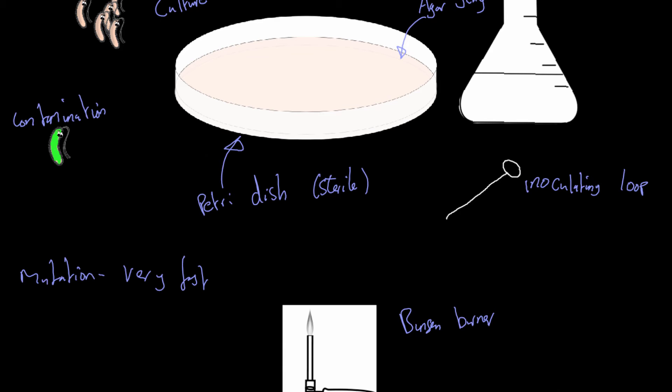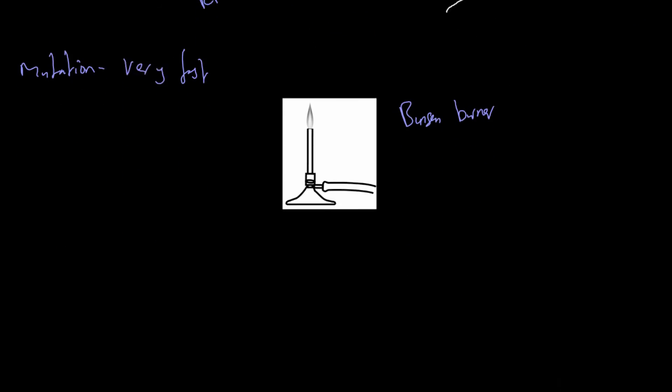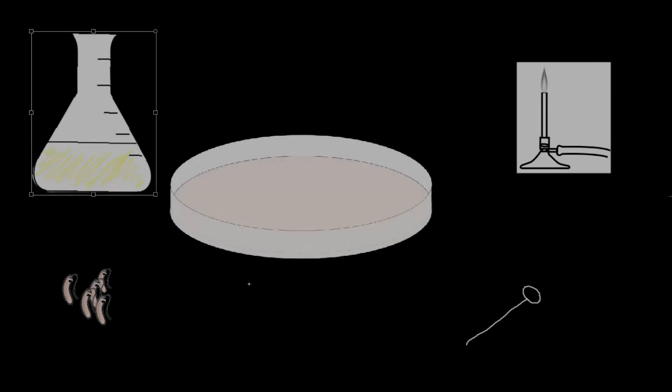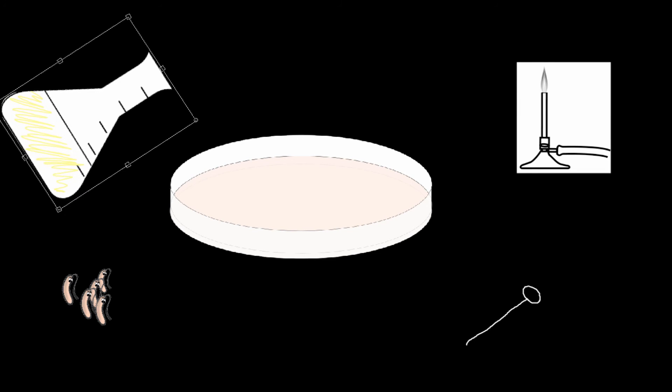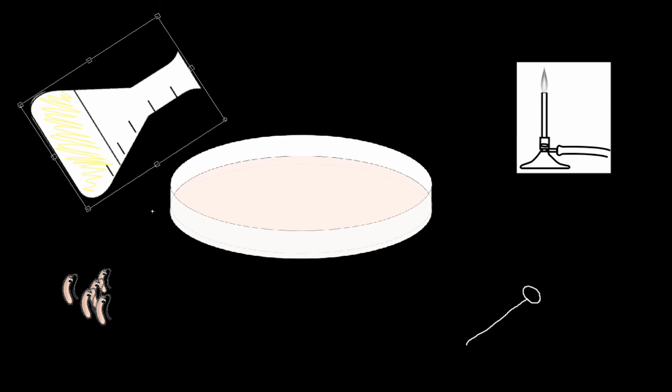So I think that's enough about the equipment we need and how we carry it out. Let's have a look at the process itself. Here we have all our equipment. We have our sterile beaker of hot agar, and what we're going to do is just pour that onto our petri dish. Now we have our agar on our plate. We let that settle and it solidifies into the agar jelly.